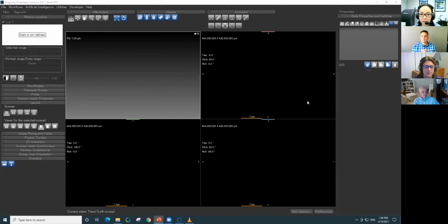So let's talk about that. Okay, so this was a multiple choice question. It doesn't need to be just the voxel size. And the second one I said it was a file format, and most of you got it right. So let's see what happens when we open the scan.